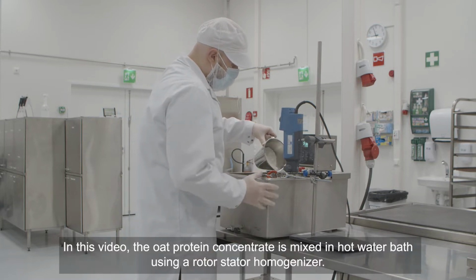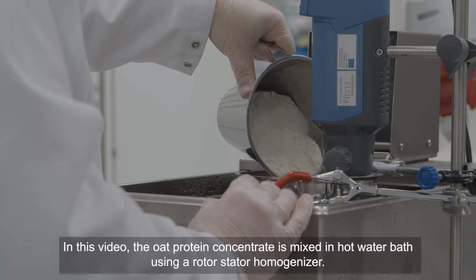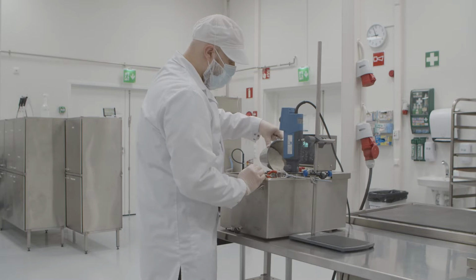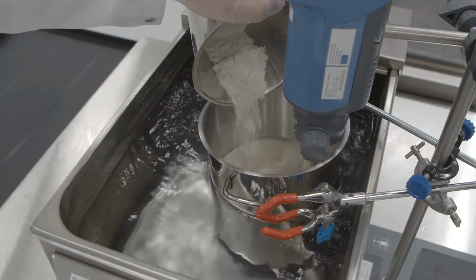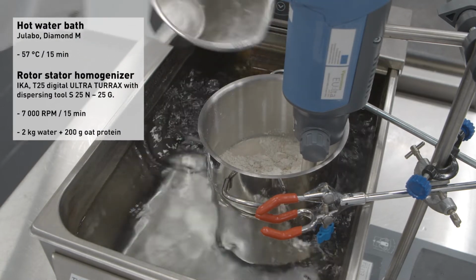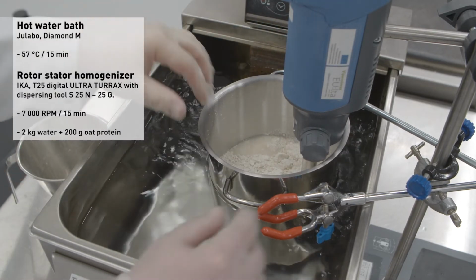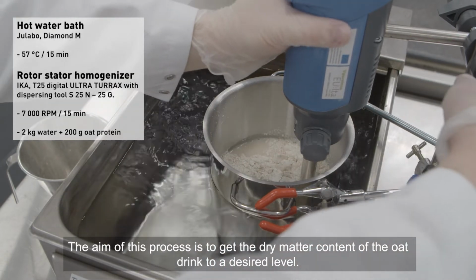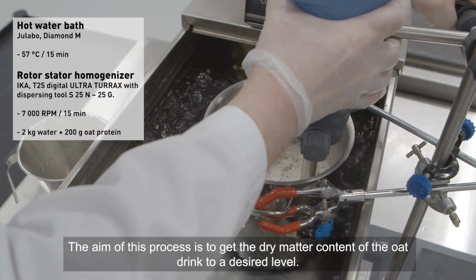In this video, the oat protein concentrate is mixed in a hot water bath using a rotor stator homogenizer. The aim of this process is to get the dry matter content of the oat drink to a desired level.